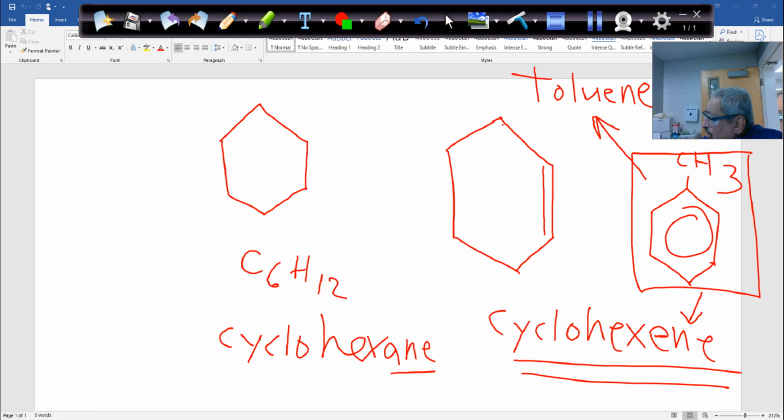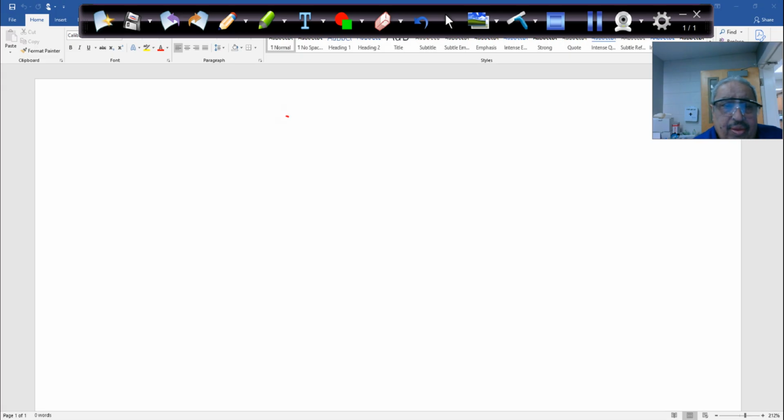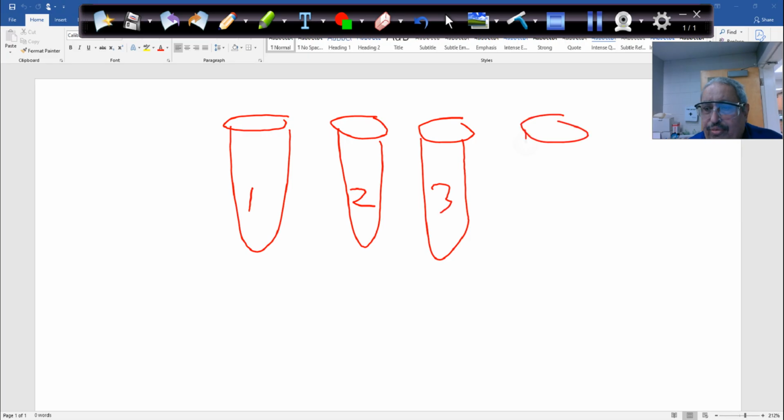So your unknown will be one of those 3. Your unknown will be what? One of 3. So let's see. The first test you will do here today is to test their physical properties first. So you will have 4 test tubes. 1, 2, 3, and this is number 4. To be consistent, I will add 20 drops. It says 10 drops, but it's up to you. If you want to add 10 drops or 20 drops is 1 milliliter. Let's add 10. Let's be consistent. Add 10 drops.